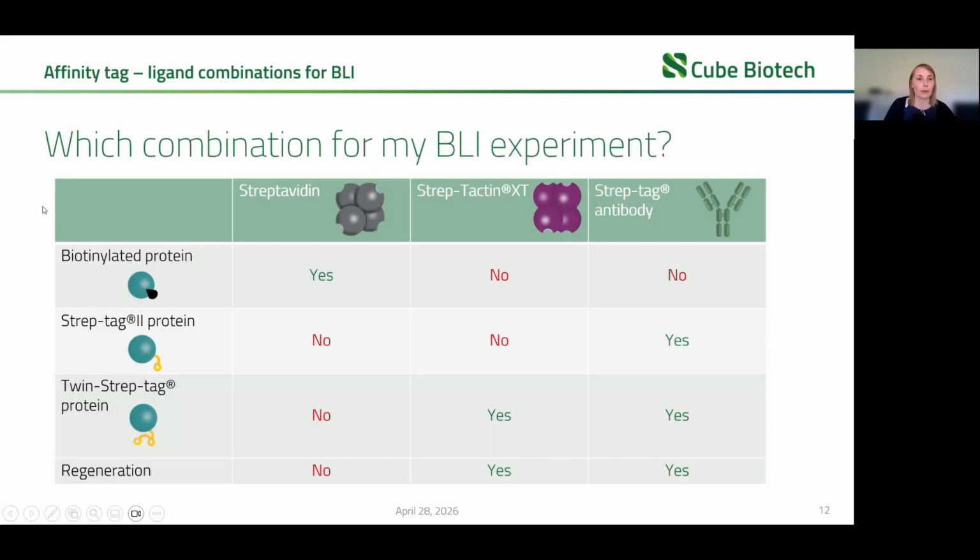Yeah, here's now the overview, so which combination you can now use for BLI experiments. And of course, streptavidin in combination with biotinylated proteins, of course, yes, but you cannot use Strep-Tag2 or Twin-Strep-tag proteins in combination with streptavidin. And also, you cannot regenerate the sensors that easily.